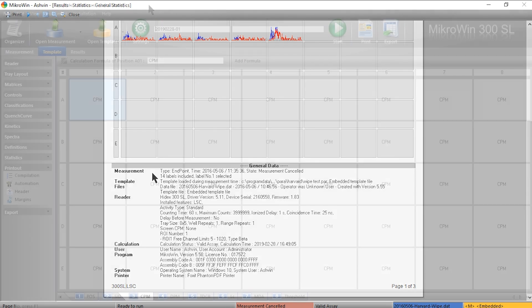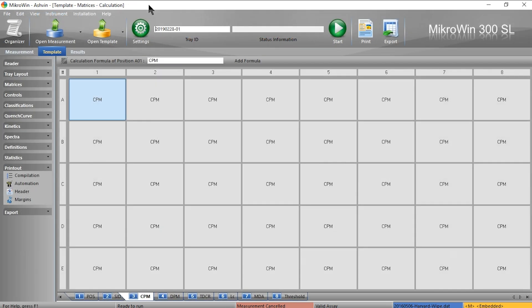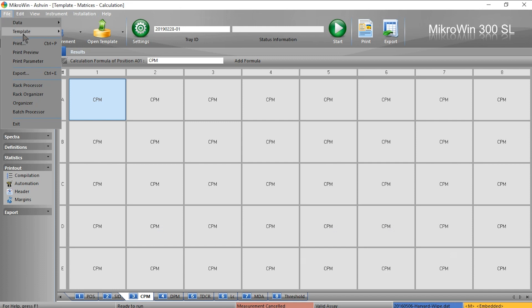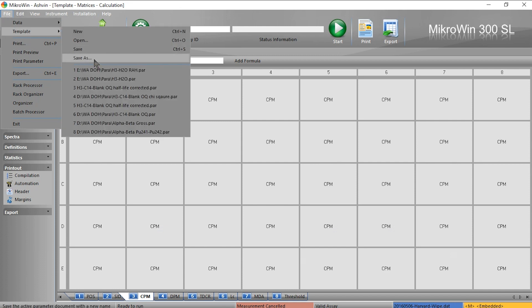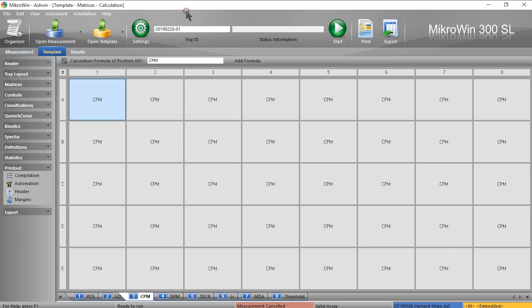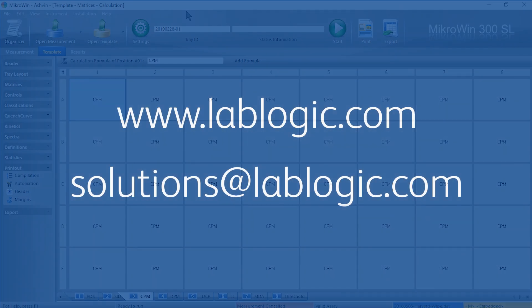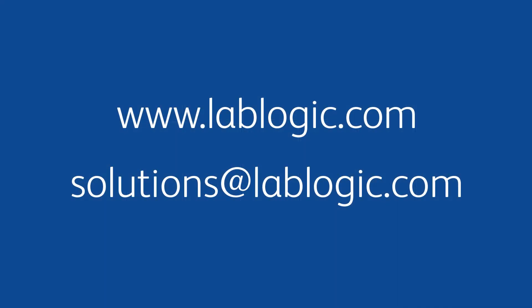If this is satisfactory, don't forget to save what you've done under file template save as, or save to overwrite the current template with these new changes. For more information please contact Lab Logic.